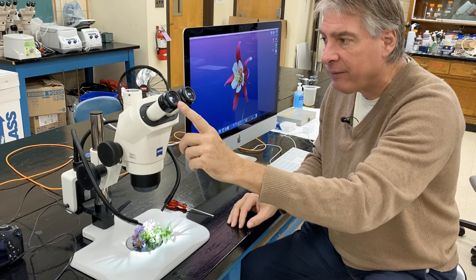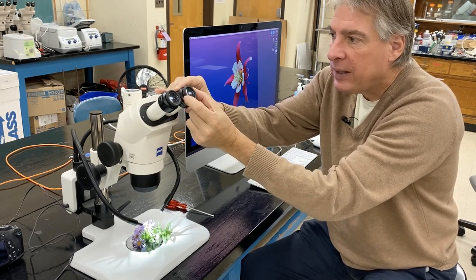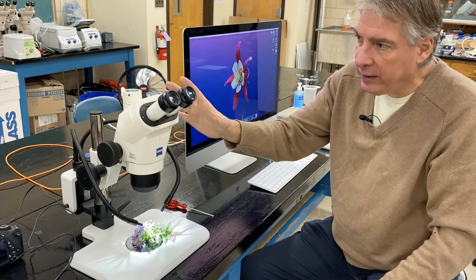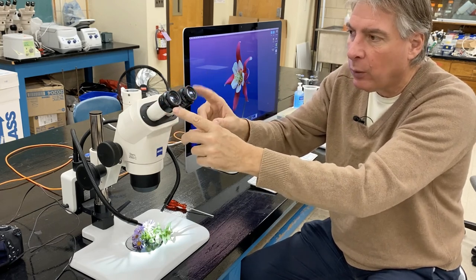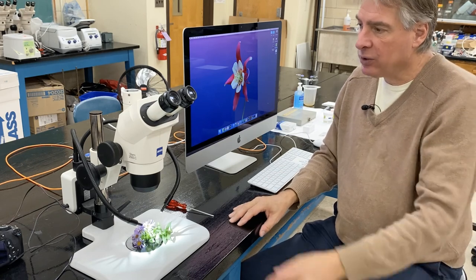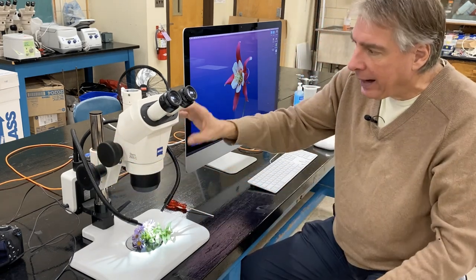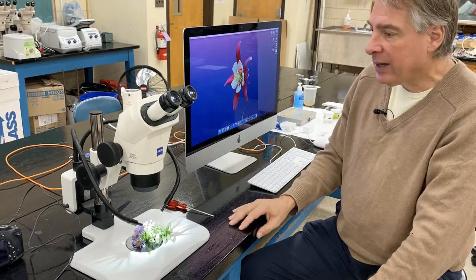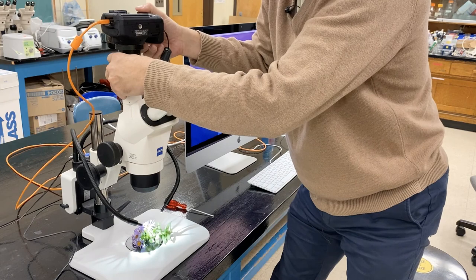Once the subject is in focus with your left eye, you open your right eye and close your left eye. Then you rotate the eyepiece, which allows you to focus your right eye to the sample. When you're finished, the eyepieces will be the right distance so it's comfortable, and things will be in focus with both eyes. This microscope is fairly simple to use compared to the compound microscope. The magnification dial lets you go from low to high magnification — it's equivalent to a macro lens on a camera, kind of like a magnifying glass.